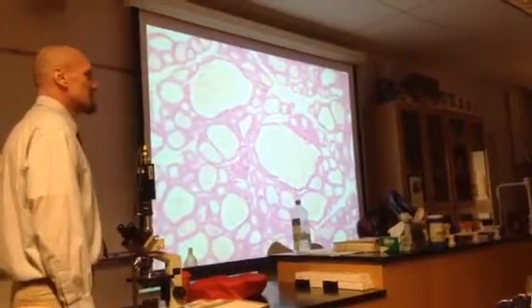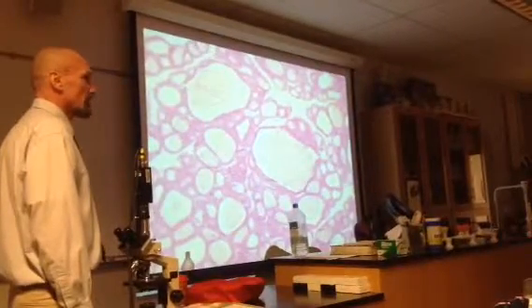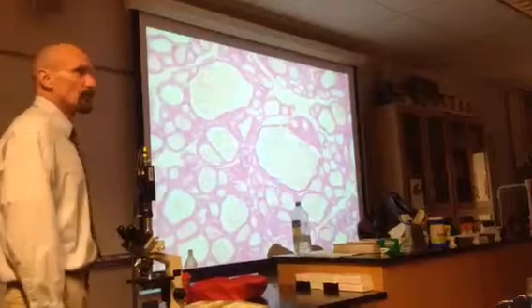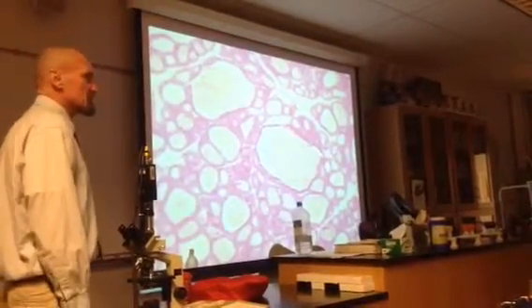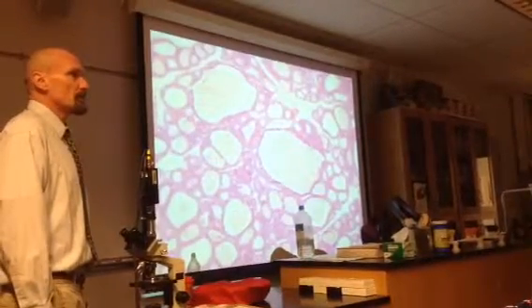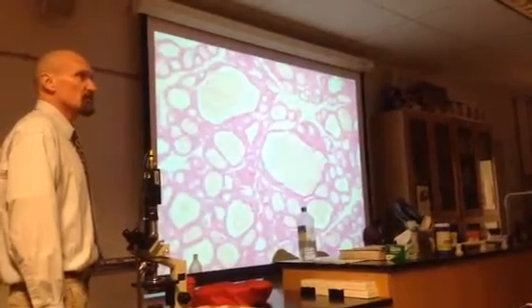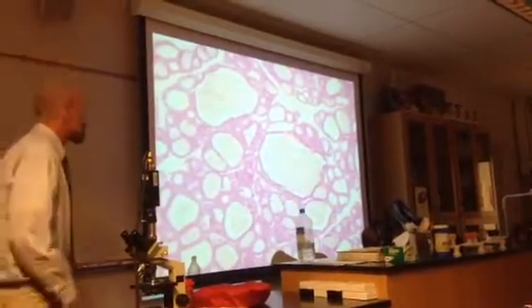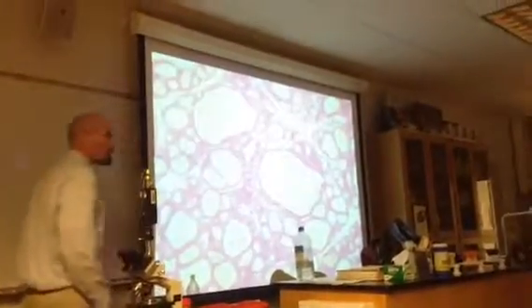And what do C cells make? Calcitonin, the other thyroid hormone that deals with calcium metabolism. So you have C cells, kind of analogous to the Leydig cells in between seminiferous tubules in the male. You've got C cells that make the hormone calcitonin.